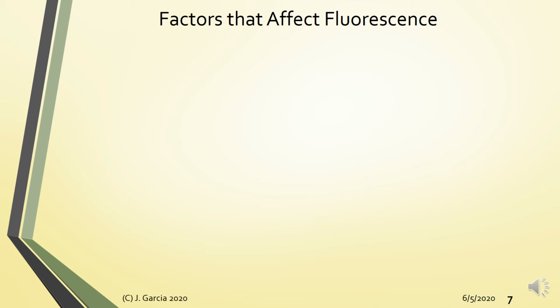Why is that? Because there are several factors that determine whether a given molecule will exhibit fluorescence. First is the structure, something about the structure of the molecule. So what are the structural features of a molecule that can undergo fluorescence?